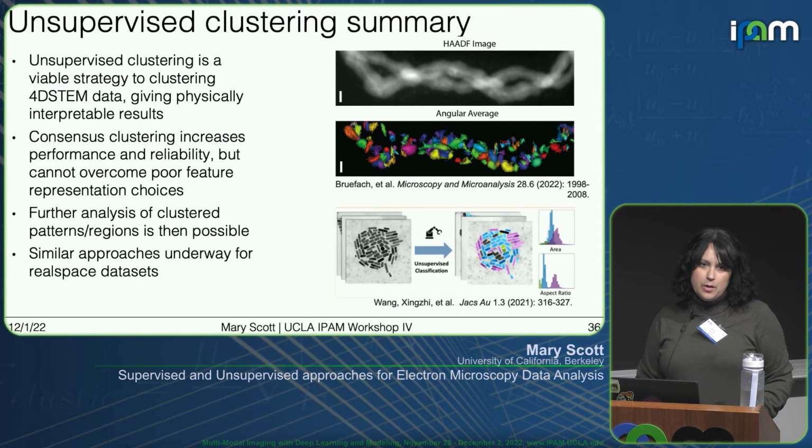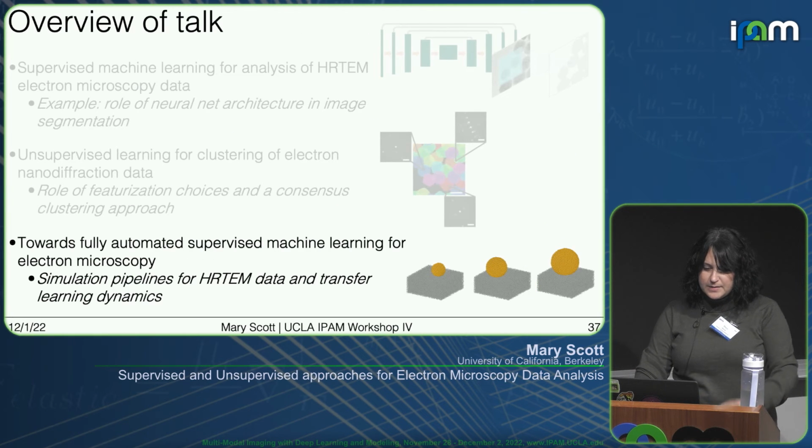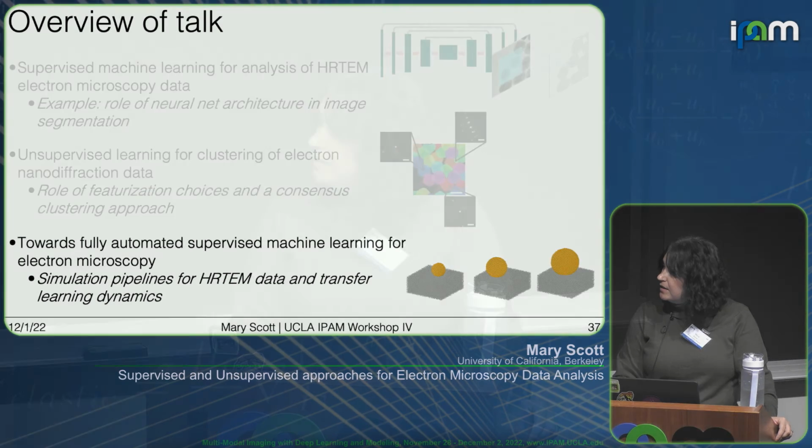It's also a really viable approach for HRTEM and other electron microscopy imaging modalities. Okay, so for the last bit of my talk, I think I have about 10 minutes left, but I'll try to leave some time for questions. I want to quickly go over a fully automated supervised machine learning approach that we are developing in our group.